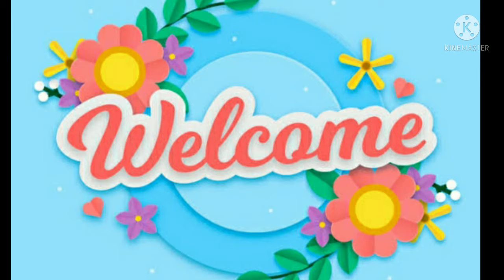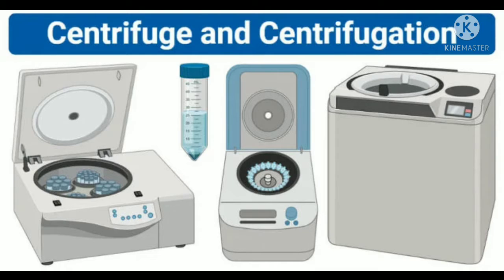Today I have a new topic which I want to talk to you about, that is the centrifugation machine. So what is centrifugation? First we have to know that, then we will know in which places the centrifugation machine is useful, or what the usefulness of the centrifugation machine is. A centrifugation machine is a machine, or centrifugation is a process, where we can separate the heavy part from the lighter part.